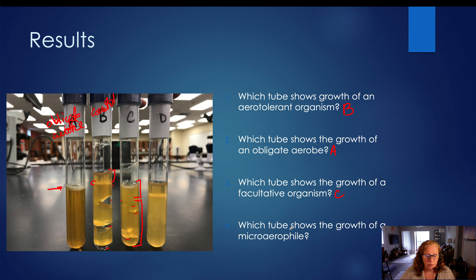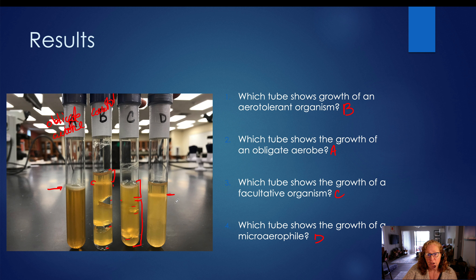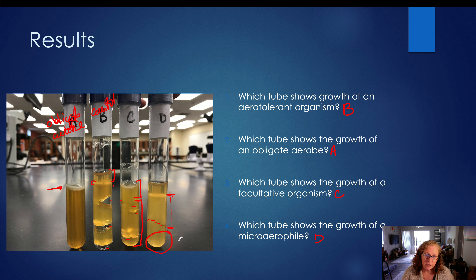That means the last tube, D, is our microaerophile. No growth where we have lots of oxygen — the tube is very clear at the top, looking almost like our aerotolerant organism. Growth starts where the oxygen gradient is finally low enough, continues throughout the middle of the tube, and then stops where O2 levels are too low. The bottom of the tube is nice and clear. So this is the aerotolerance test. I hope this was helpful in understanding how to read these aerotolerance test tubes and helps you with your practical exam.